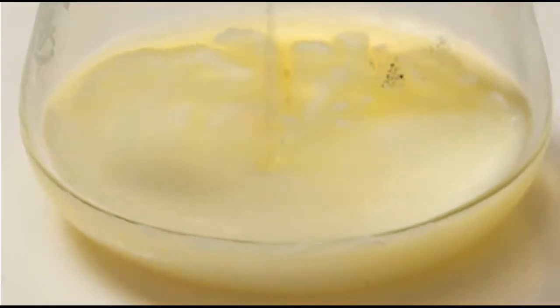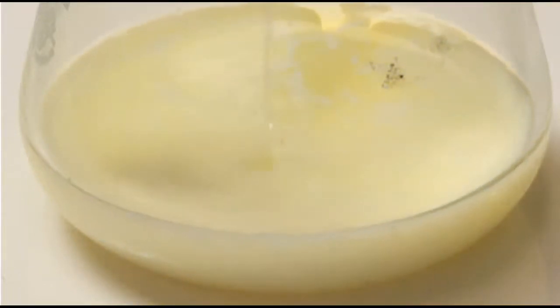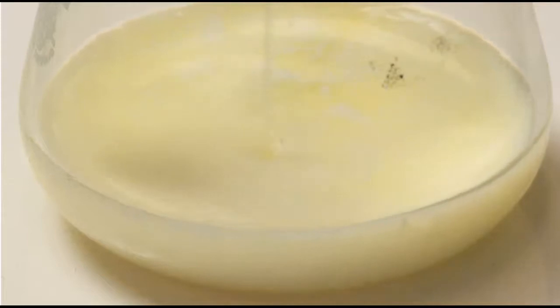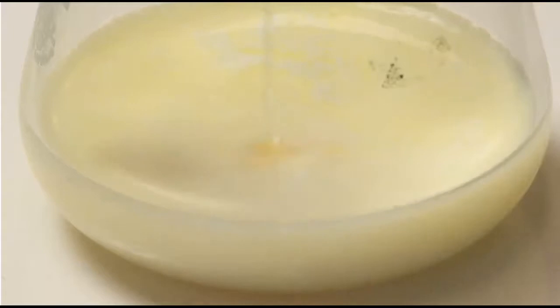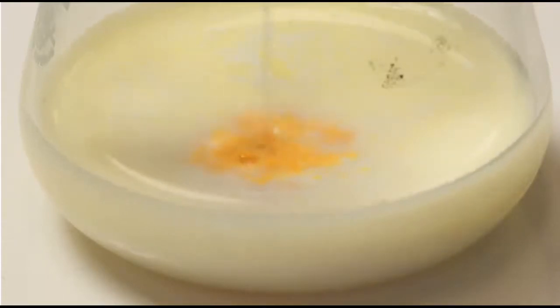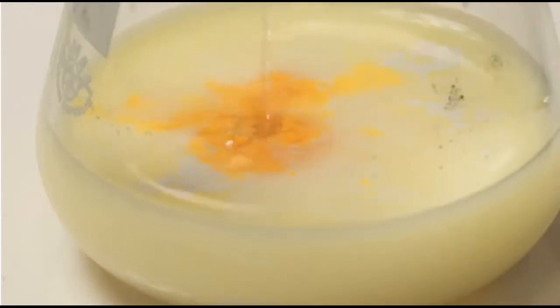The silver nitrate solution is added to the conical flask containing the chloride ions and the indicator until the colour has changed from yellow to orange. Once the colour change has occurred, the endpoint has been reached. The volume of silver nitrate needed to cause the colour change is used to determine the concentration of chloride ions in the seawater sample. The titration process should be carried out 4 times, once to get a rough idea of where the colour change will occur, and then 3 more times to get more accurate values.